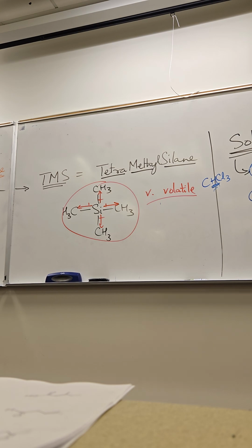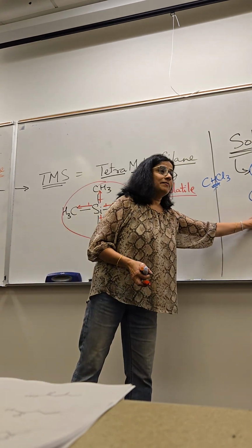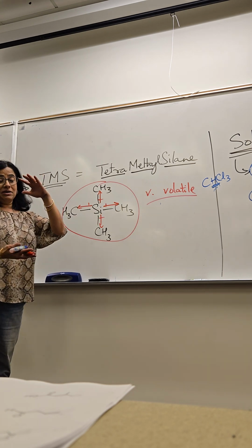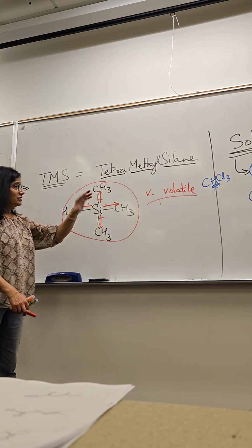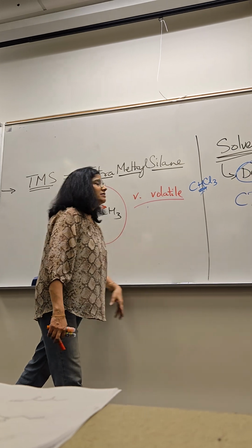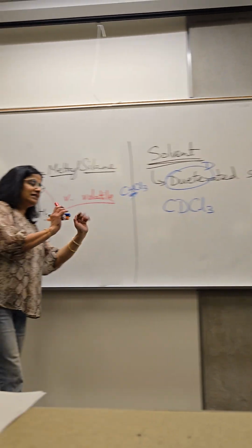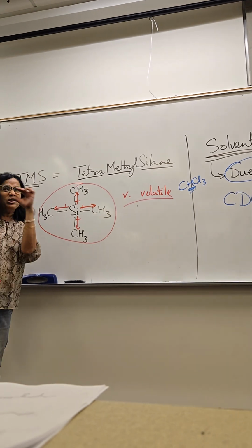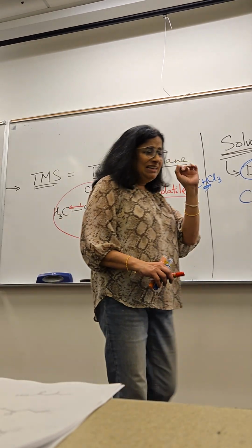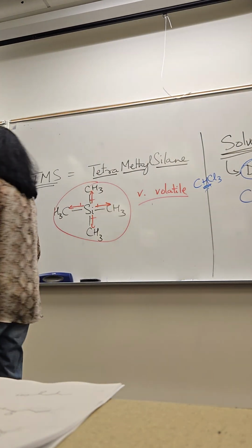C, it's more expensive than that. When we buy chloroform, we can buy a big bottle and keep it in the fridge. It's great because it's also somewhat volatile, it evaporates reasonably quickly, so we can store it in the fridge so it's safe. This we buy in tiny bottles at a time and we make sure, please, one drop, just one drop, because it's way more expensive. So all of those factors come in.